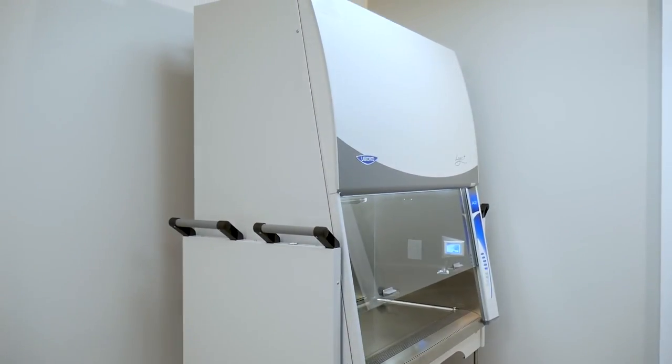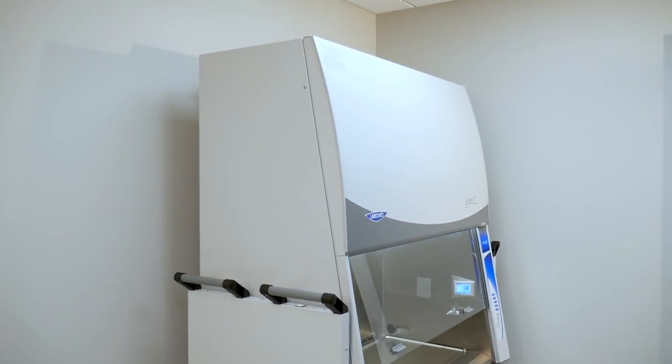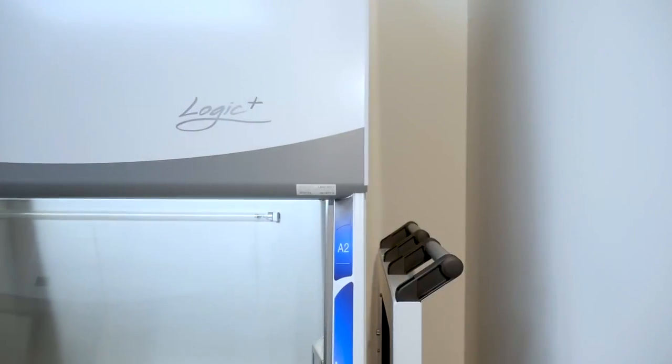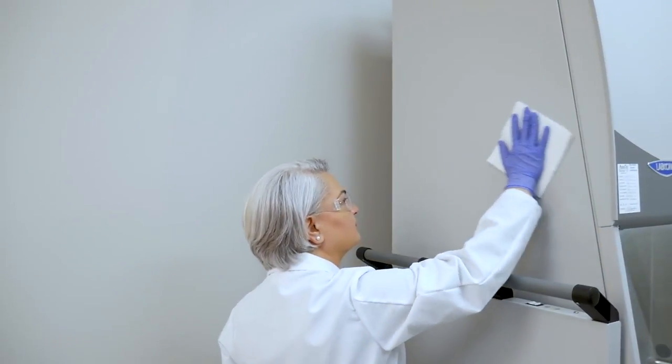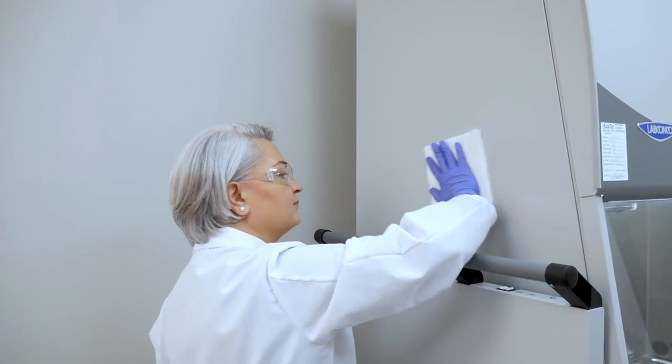A BSC should also be installed with six inches of clearance around the top, sides and back to avoid restriction of airflow entering and exiting the cabinet, and to allow for easy cleaning of the exterior.